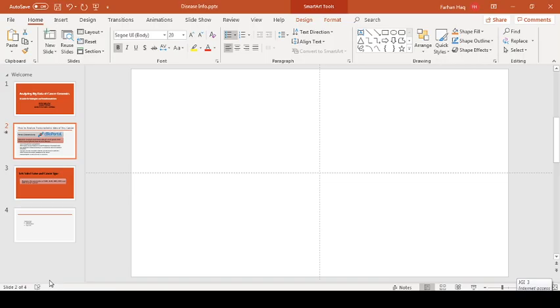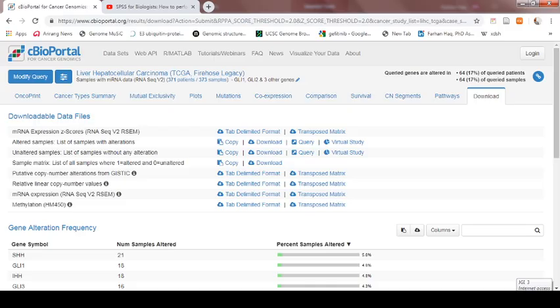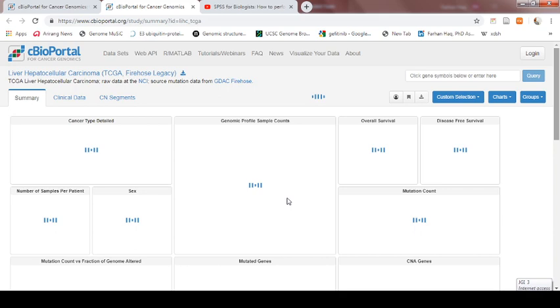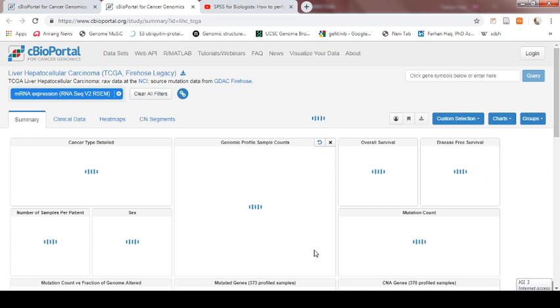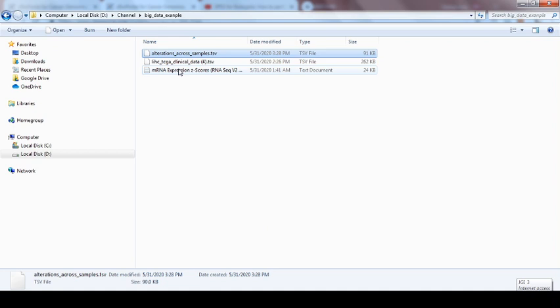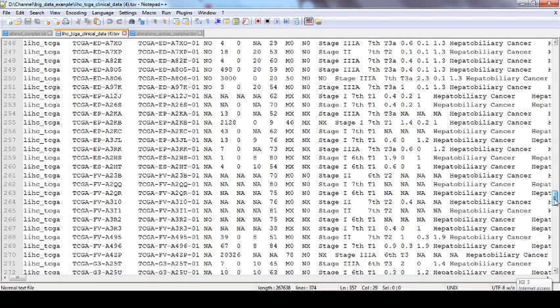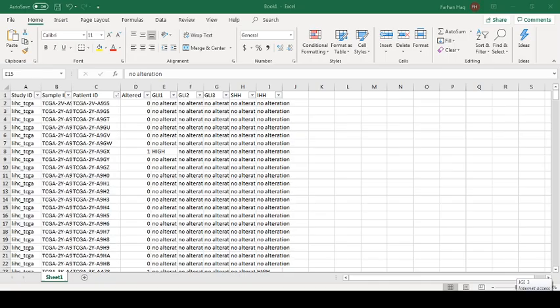Now, to analyze this information with the clinical information — for example, we want to find the association with different clinical information — we also need the overall clinical information of these patients. Again, we can download it from here. You can just click this liver cancer study, and from the liver cancer study, here we want to find association with mRNA expression. You can select this one and select the samples like this. After selecting the samples, you can just click the download button, and when you click this download button it will download the file. All the clinical information of each patient will be shown — just copy it into Excel.